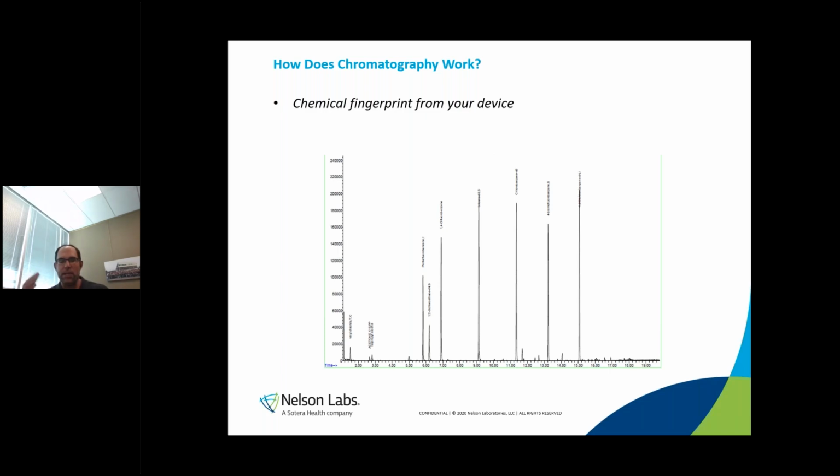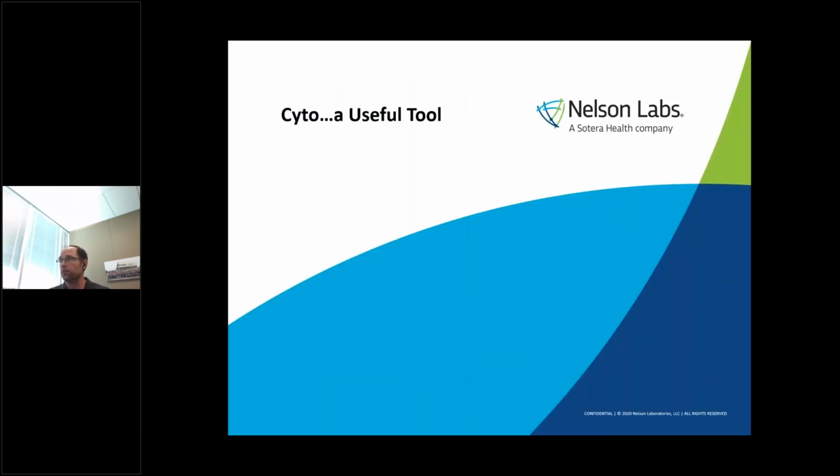As you can see, there are peaks, and we can look at those compounds. The higher the peak, the more of it's there. This gives us a way to give semi-quantitative amounts of these compounds. And this is what you can overlap if you're doing two of these, like your traditional chemistry and your new chemistry. You can overlap these to try to understand the impact of the change.